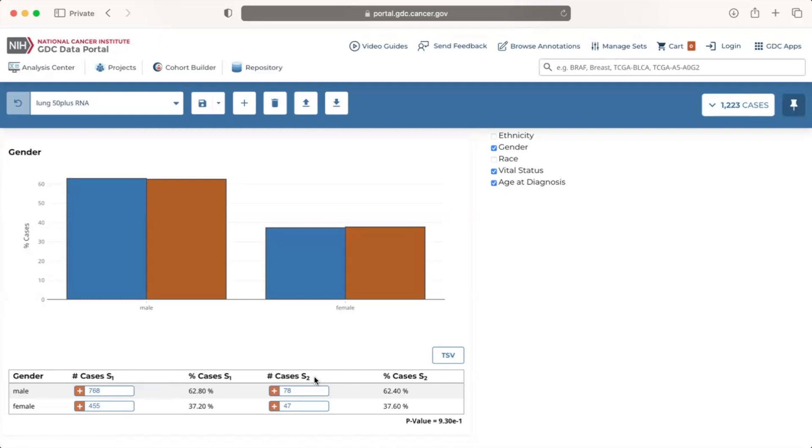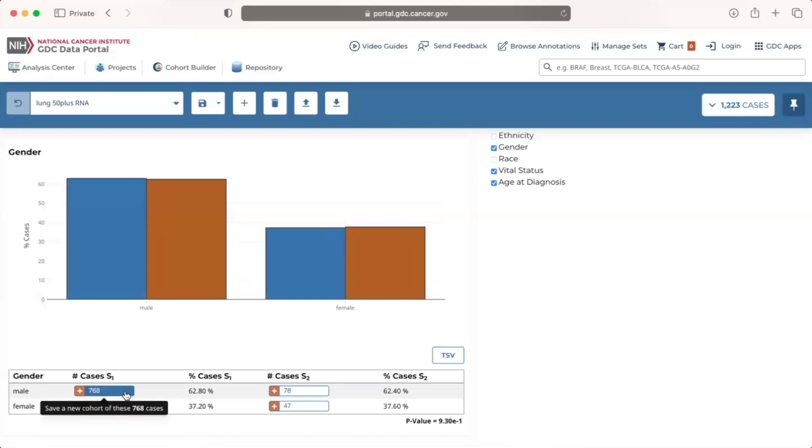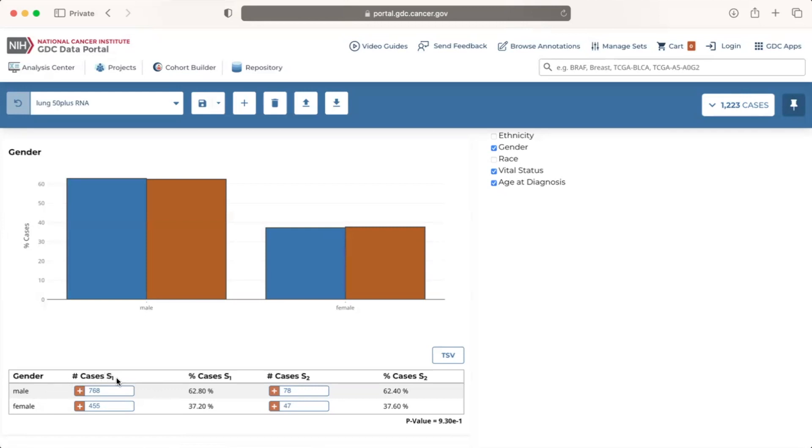These two columns contain buttons that can be used to create new cohorts based on the clinical facets category. For example, the data table for gender contains four buttons total since there are two categories, male and female, and two cohorts, S1 and S2. If there are no cases in a specific category for a given cohort, then the button will be grayed out and a new cohort cannot be created with those parameters since it would be empty.